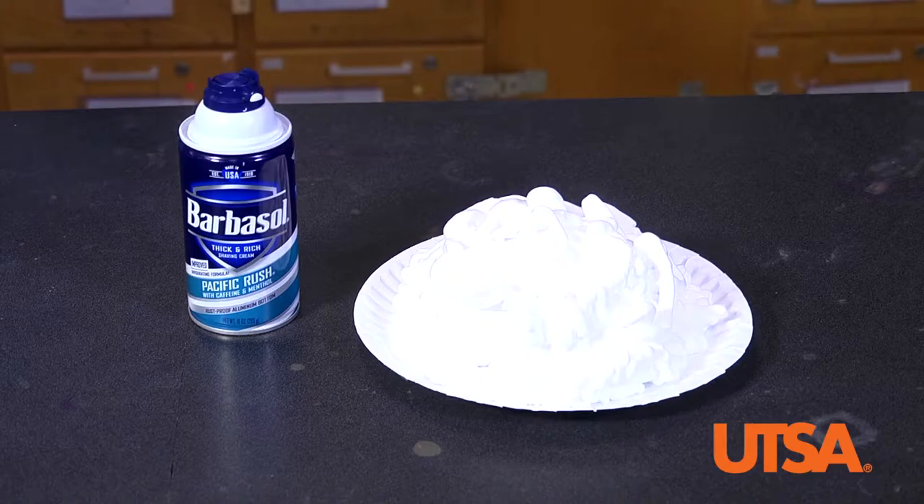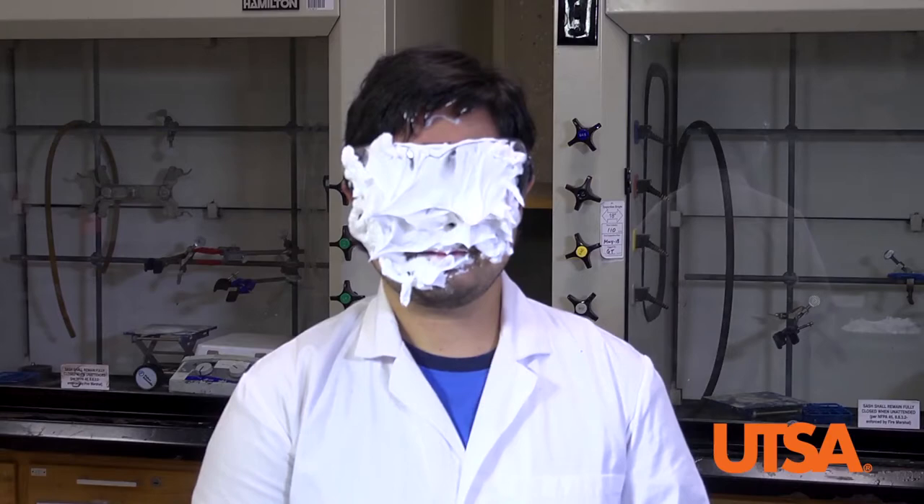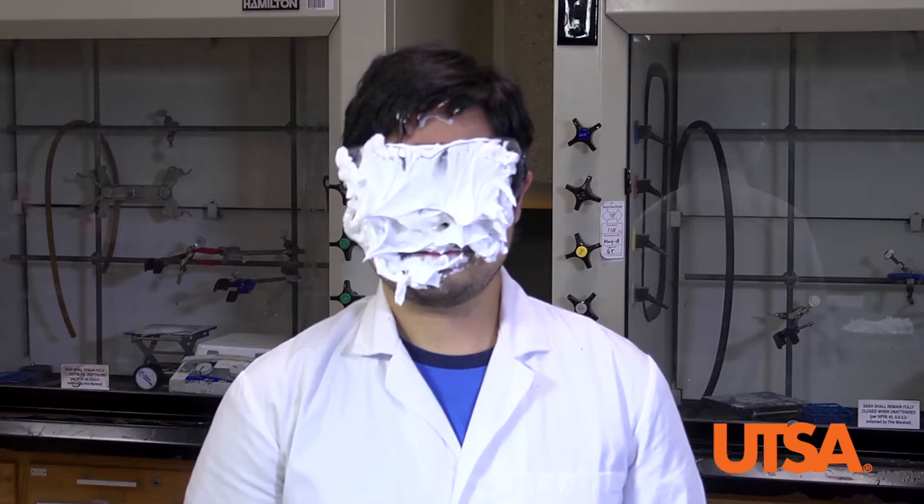The last demonstration showcases the importance of using well-fitting goggles when participating in labs. When doing this demo, make sure you're wearing a lab coat and bring a spare shirt in case of spills. Load up a pie tin or styrofoam plate with shaving cream. Explain to your students how the shaving cream represents a chemical spill and will allow them to safely see how goggles can protect their eyes. When ready, allow another teacher to pie you in the face. After getting pied, carefully remove the goggles to allow students to see how well the goggles protected your eyes from the shaving cream.